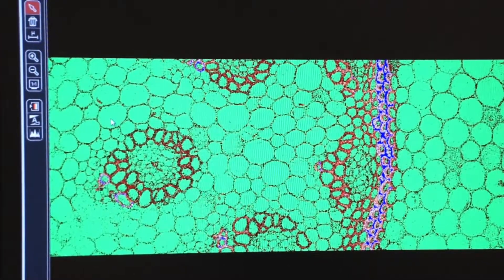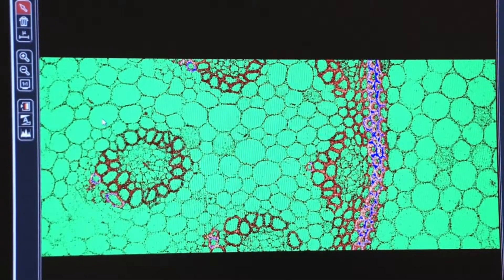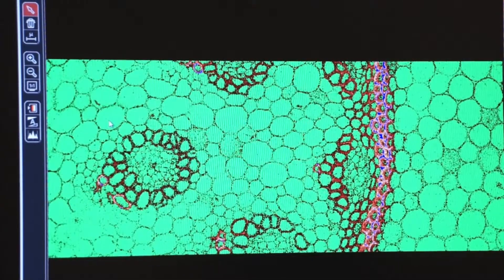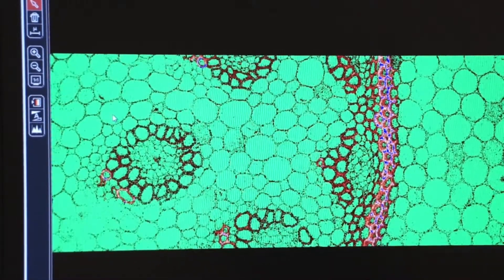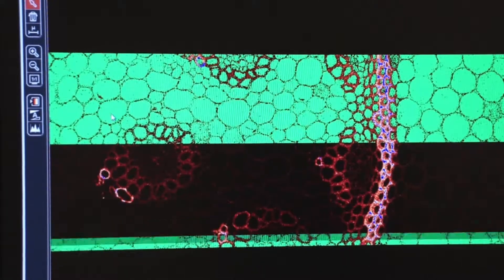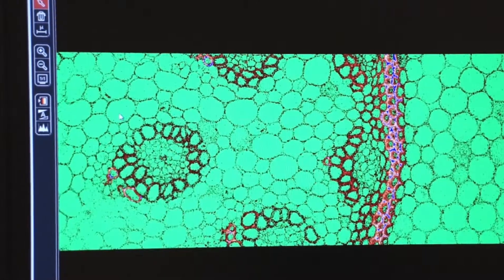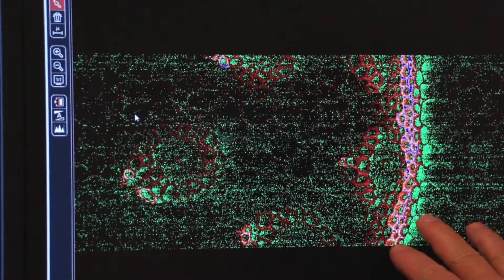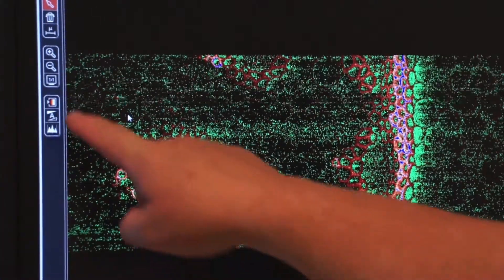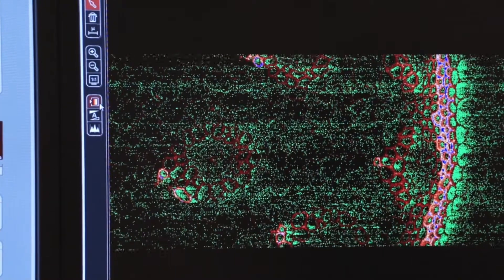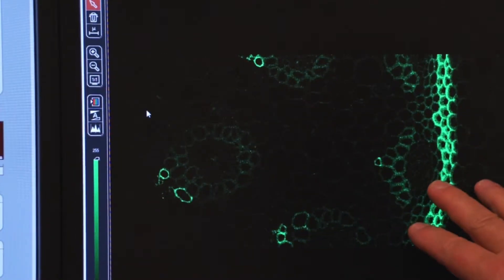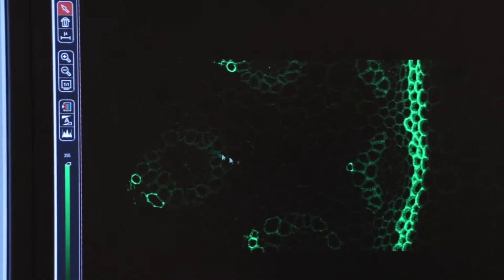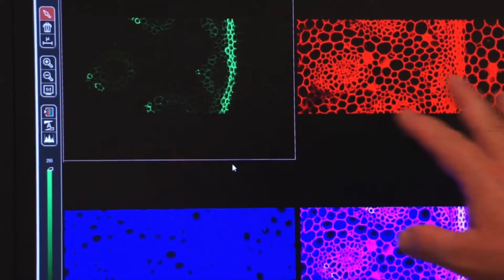If we lower the smart gain, we make some of our blue pixels go away. So we have few blue pixels. And use our smart offset until the green pixels just go away. Now we have a perfectly set image. We'll click through our lookup table, and now our FITC is set perfectly. If we double click again on the FITC window, the other windows come up again.